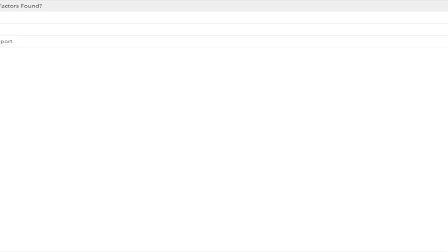So I'll give you guys a few more seconds, and we'll see what the results are. I'm just going to quickly read one question to you, and that was, how are the ideal response factors for a cal gas calculated? We'll actually go through that later on in the presentation. We will talk about how you get the ideal response factors, and really things we like to look at is the ideal relative response factors. So we'll look at that.